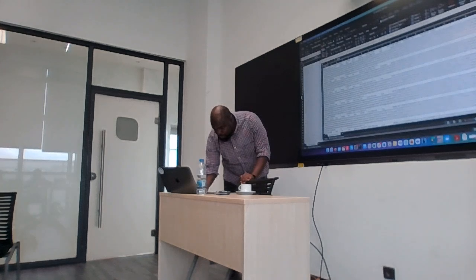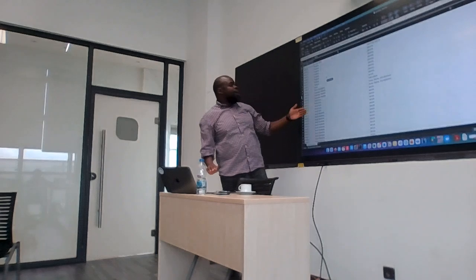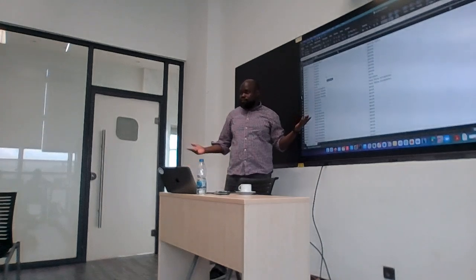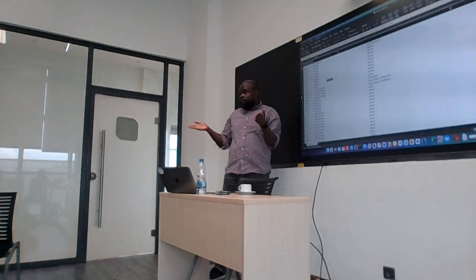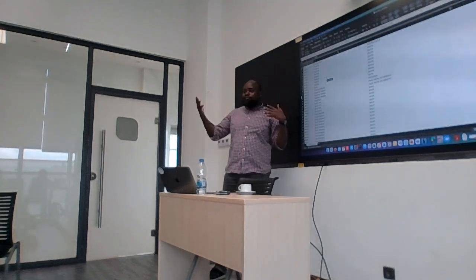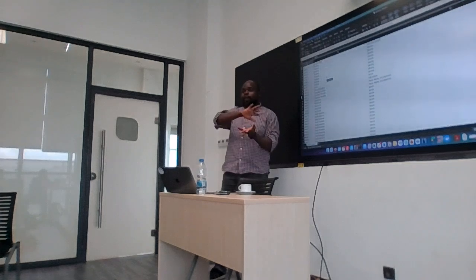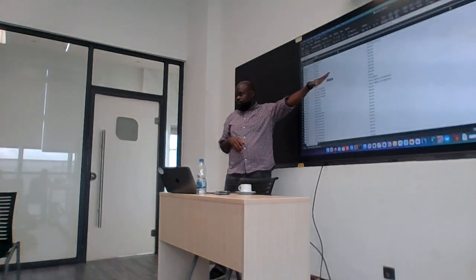Finally open this. Like you see, I have location's name. Because we have the information from GenBank, I can even get the city or the province, which I can't just get with a FASTA header, correct? But remember, this requires a bit more bioinformatics processing, okay? So I had to use a script that takes in the GenBank file and converts that information to a tabular format, table format, okay?